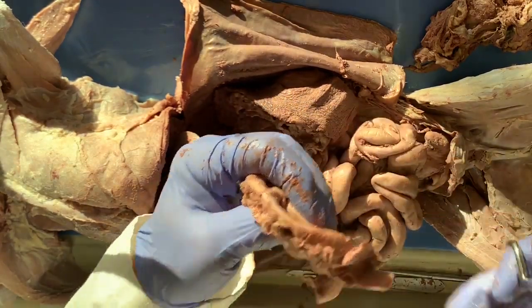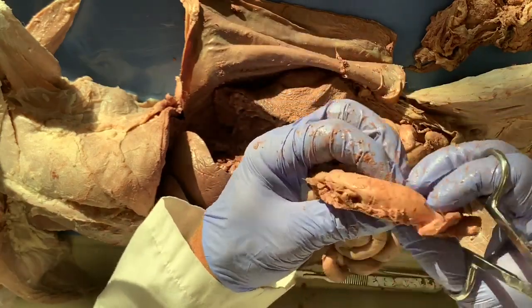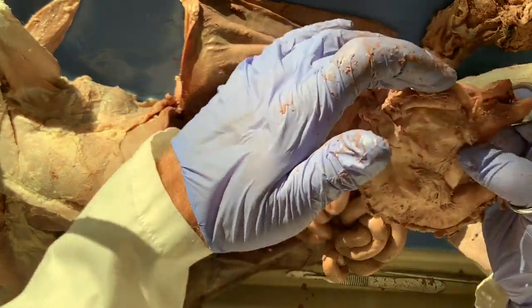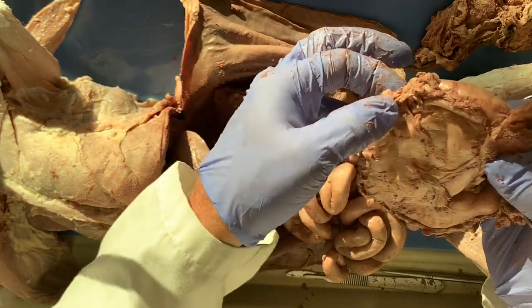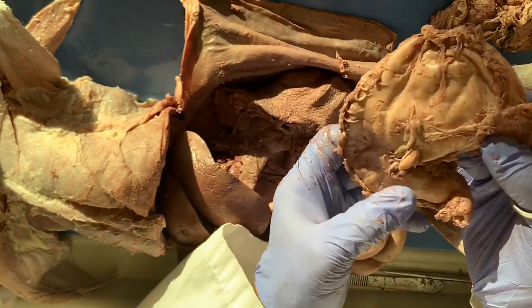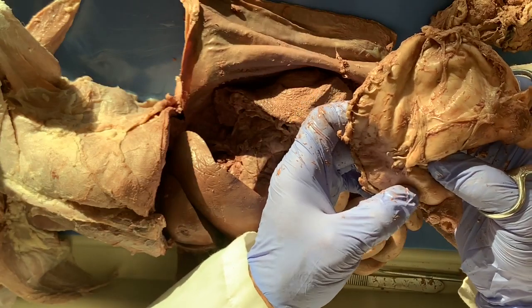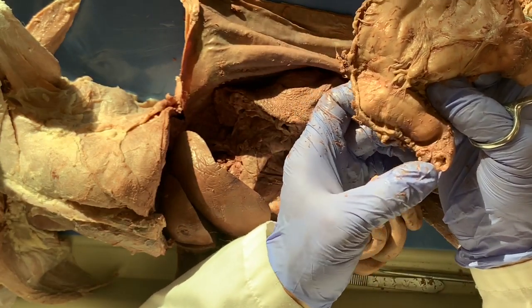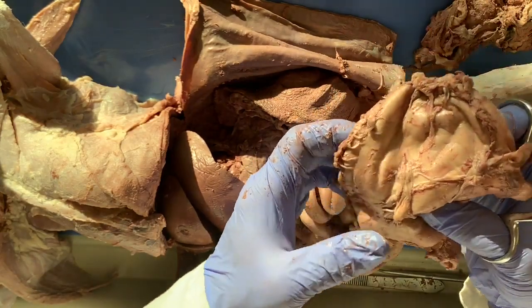So actually, while the camera's going, I'm just going to do what's called a butterfly cut. So I'm going to go all around the perimeter. You can see this is called the fundus, the upper part of the stomach. This is the body of the stomach. And then as it comes down here, we have the pylorus, which is like an antechamber. And this is where the food collects before this pyloric sphincter opens up, and then the food exits out of the stomach into the small intestine, okay?